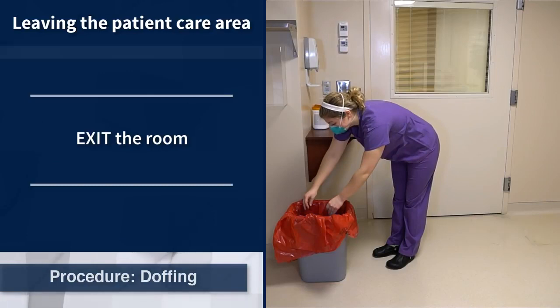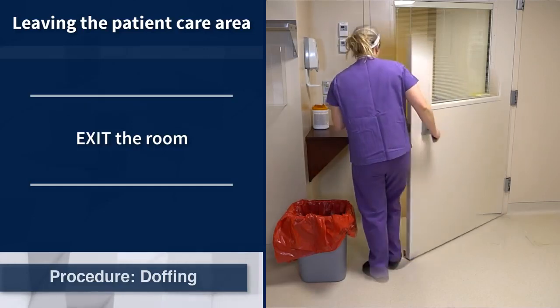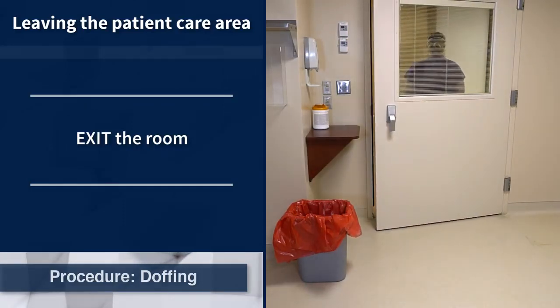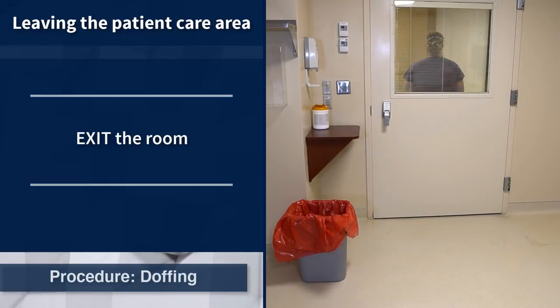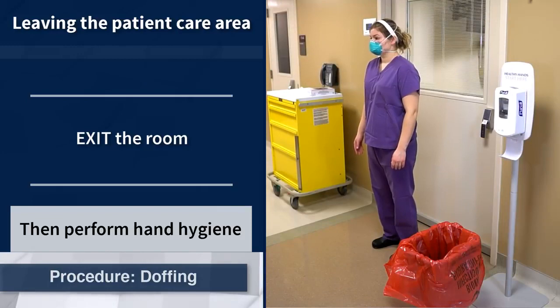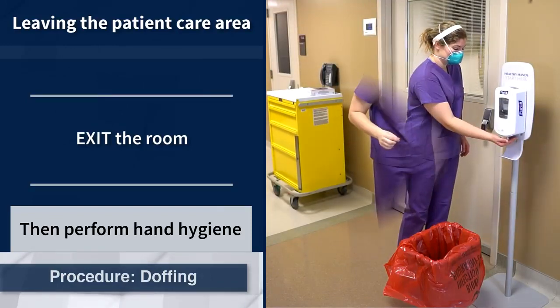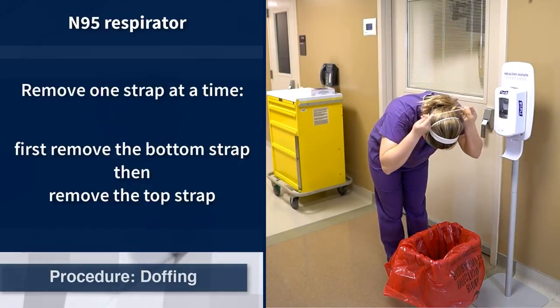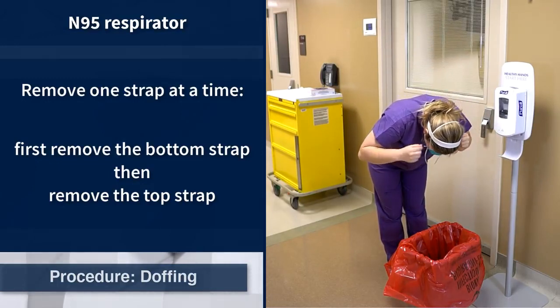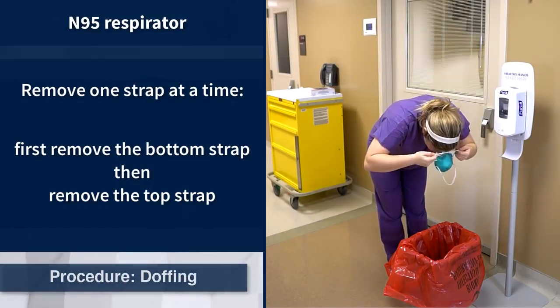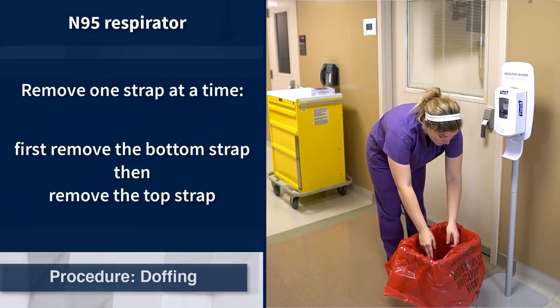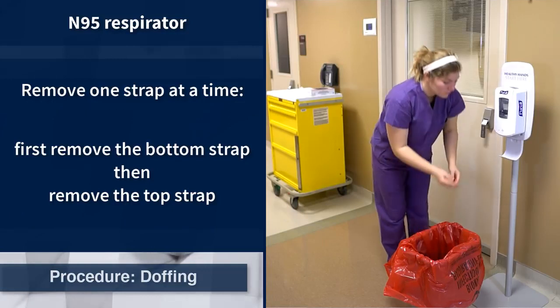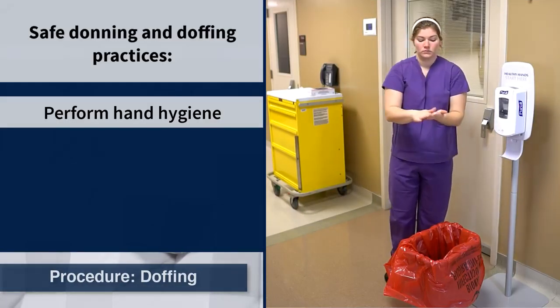The only item of personal protective equipment remaining at this time should be the N95 respirator. Exit the patient care room by opening the door and step out. Ensure the door closes immediately and completely. Perform hand hygiene. To remove the N95 respirator, pull one strap at a time over the head beginning with the bottom strap. As the top strap is removed, keep hold of the strap and use it to guide the N95 respirator into the trash. Perform hand hygiene.